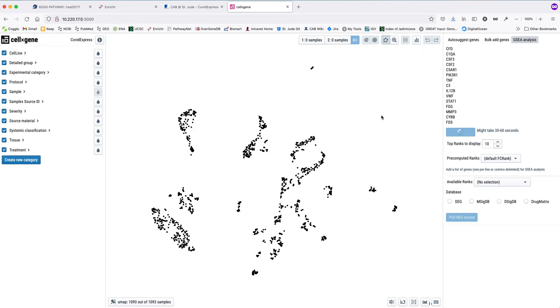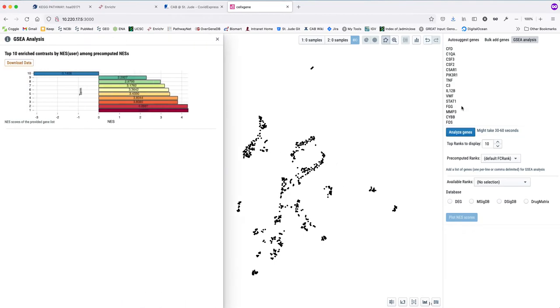So there is going to be some variability, but if the signal is, for example, let's say those genes would be upregulated, from what we observed using GSEA not only here but in research every day, those strong signatures are always there, and we are going to show the top 10. Usually those could be a different top 10, but still they would have the same direction.